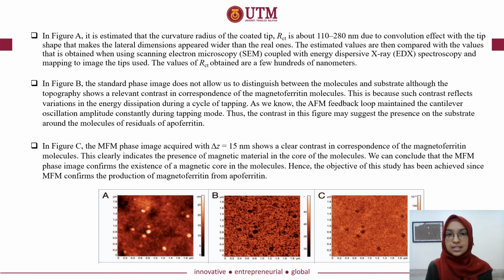Now, let us discuss the results that we obtained. In Figure A, it is estimated that the curvature radius of the coated tip is about 110 to 280 nanometer. This is because of the convolution effect with the tip shape that makes the lateral dimensions appear wider than the real ones.